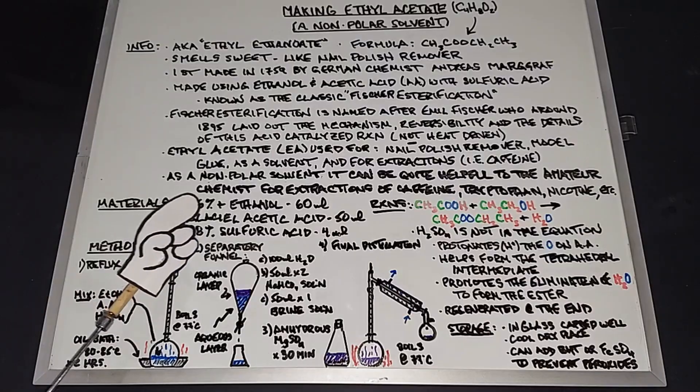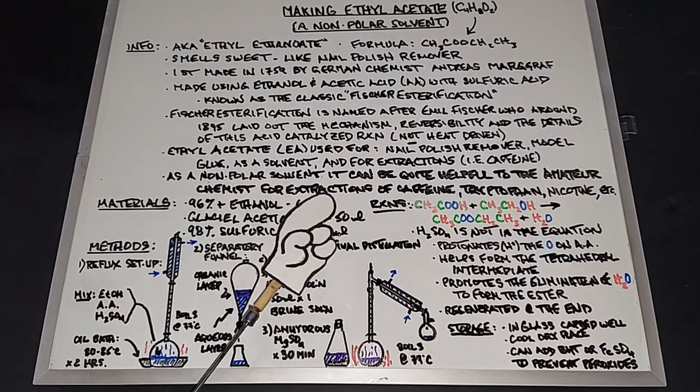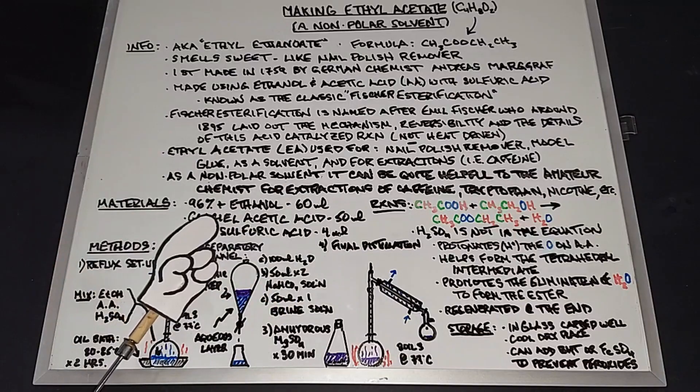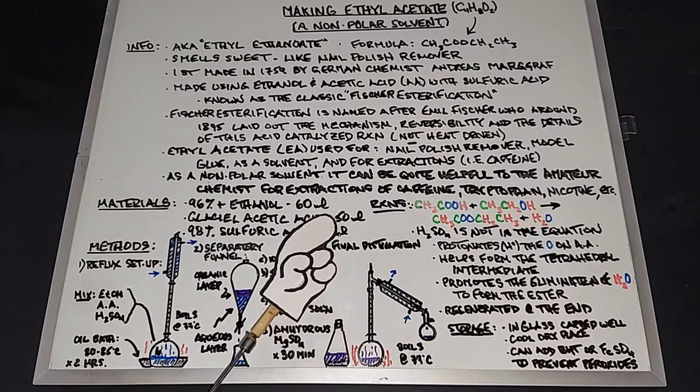In our materials, we need 96% or plus ethanol, 60 milliliters; glacial acetic acid, 50 milliliters; and 98% sulfuric acid, 4 milliliters.